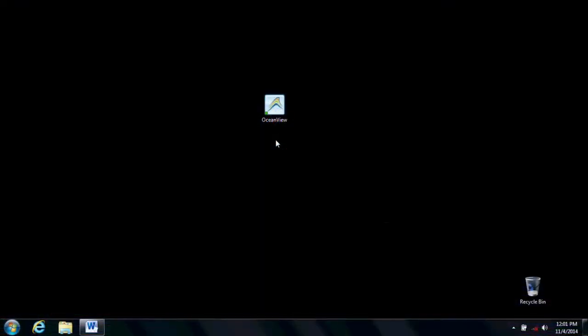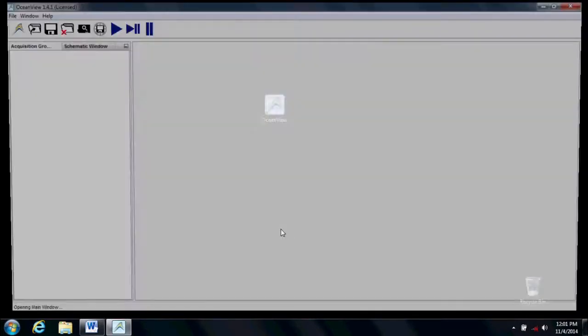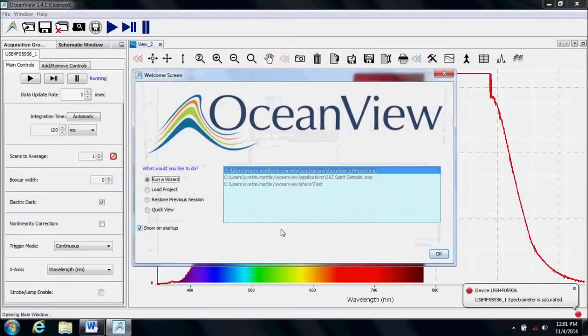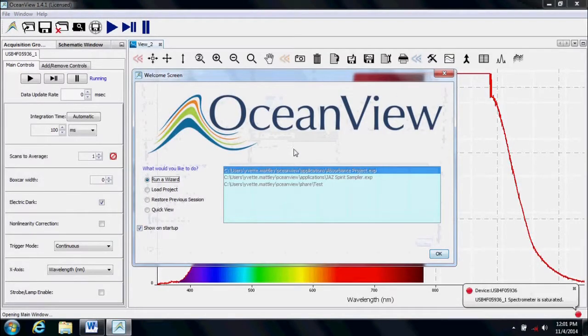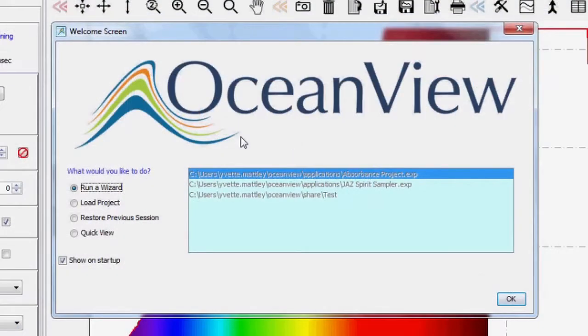Welcome to your OceanView software. Click the OceanView icon on your desktop to start OceanView. When OceanView first opens, you're greeted by a welcome screen with several options to get you up and running very quickly.